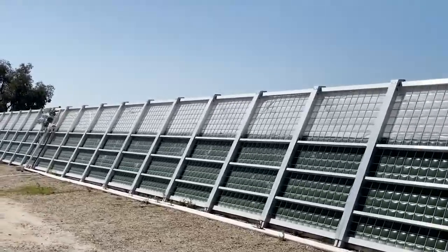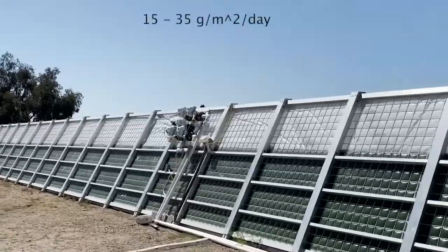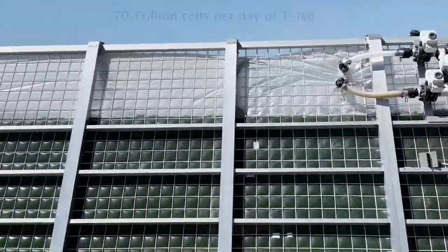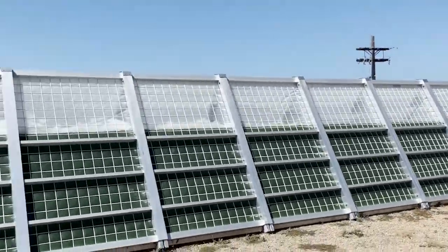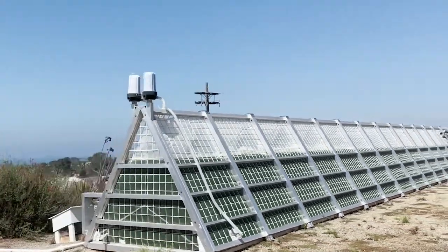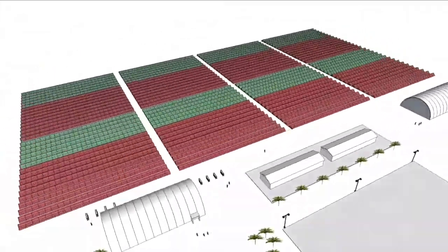The setup requires minimal land preparation, and the entire unit can be set up in less than one week, including the grading of the land. This system is very productive and can produce 15–35 grams per meter squared per day, equivalent to over 70 trillion cells per day of T-ISO. We're nearing completion of the TRIPAR's development and anticipate it being available for purchase by the end of the year. Our vision is to soon have fields of TRIPARs dedicated to the production of microalgae for a variety of products.